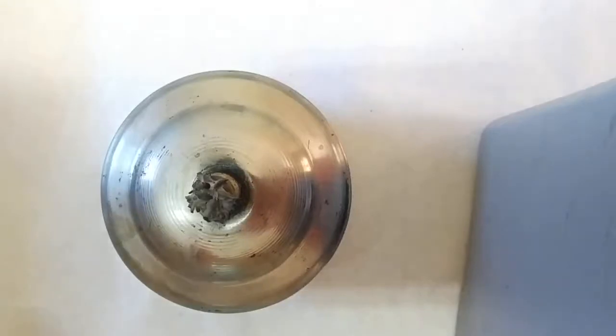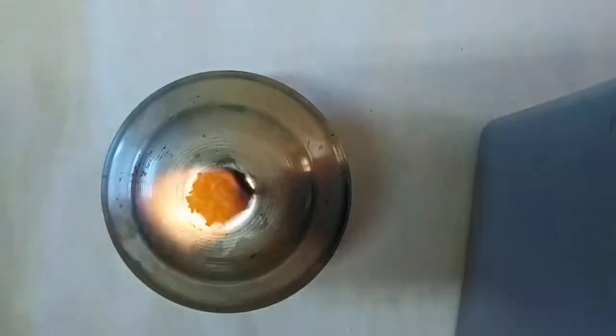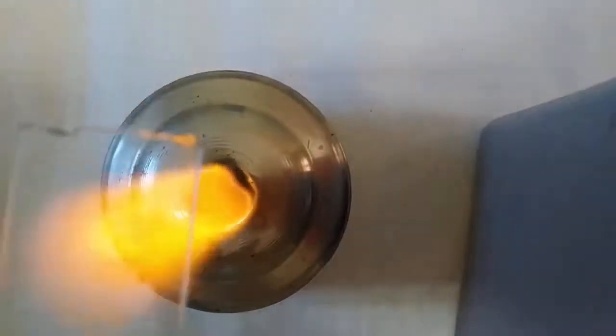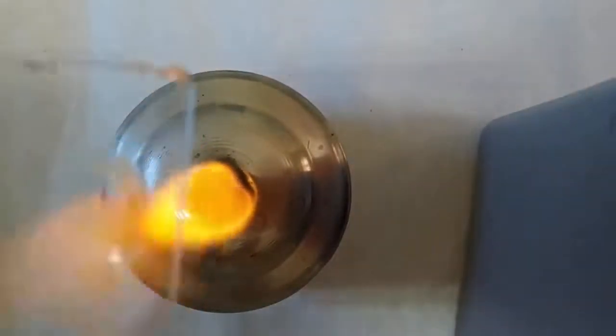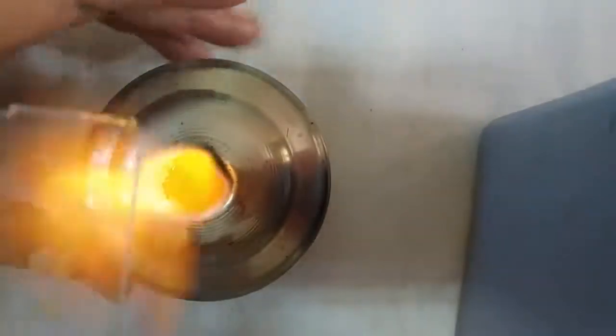Before we process the slide, we need to heat it. Gently heat the slide so as to melt the wax. You can see now the wax is melting.